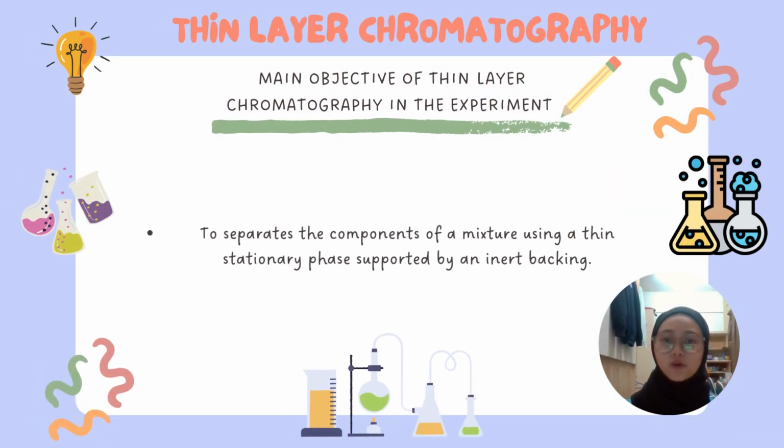So the main objective of thin layer chromatography in this experiment is to separate the components of a mixture using a thin stationary phase supported by an inert backing.